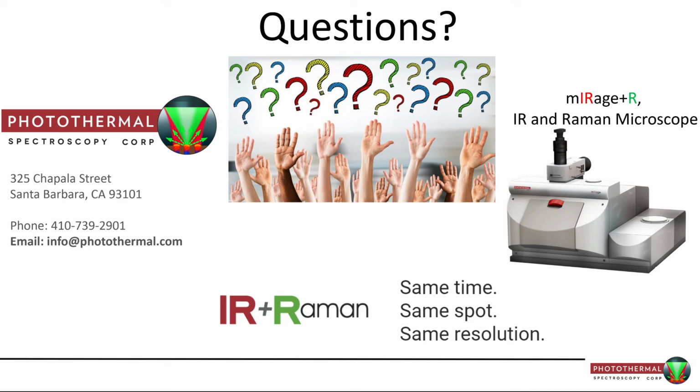Well, indeed, we were a bit concerned about this because, as I said, geranium lake is a pigment which is damaged by light exposure. So this was an option that we were considering. However, we tried to repeat the O-PTIR measurements on the particle, on exactly the same area, different times. We tried up to 20 times, and we couldn't see a variation in the spectra obtained. So for this material itself, the radiation damage was not a concern. It didn't affect the sample composition.